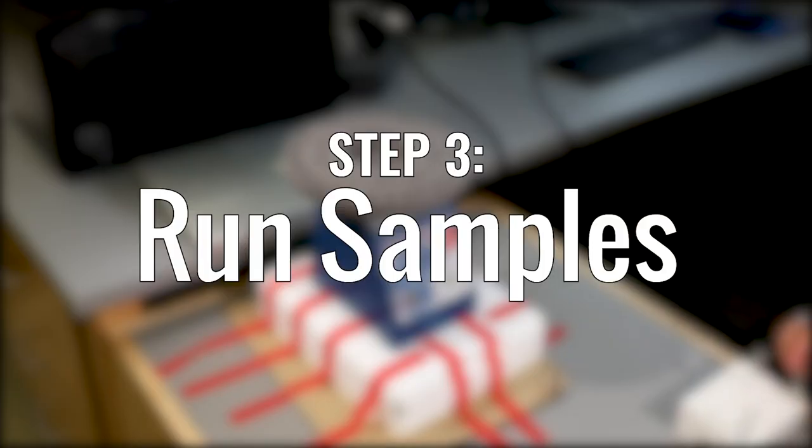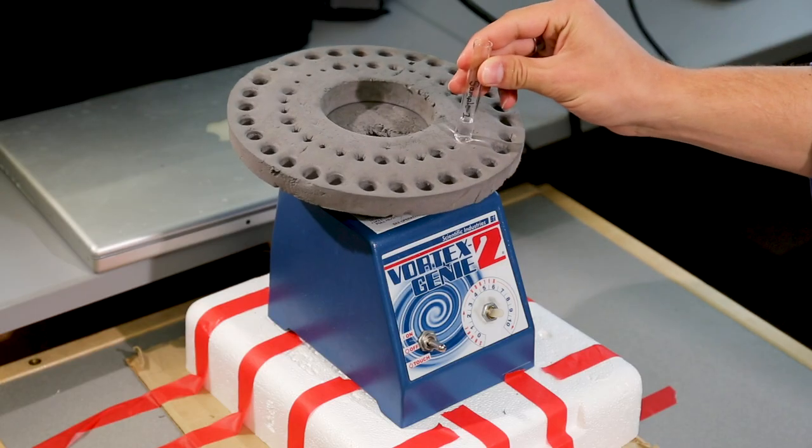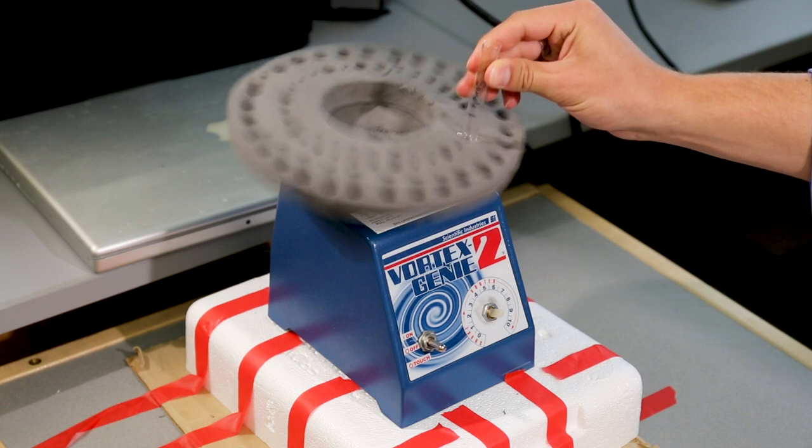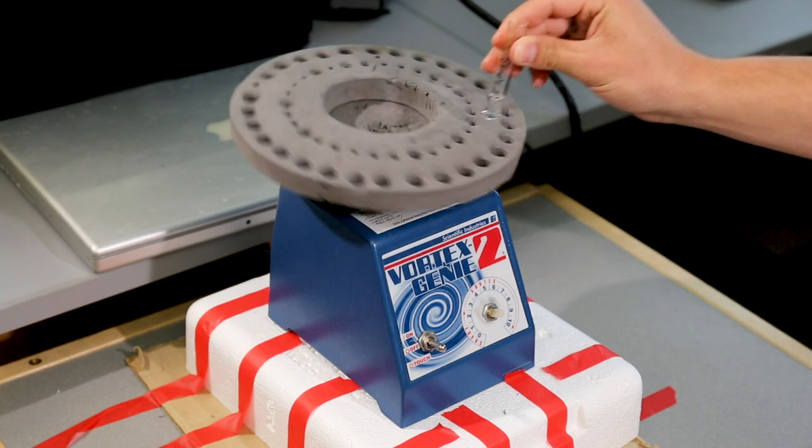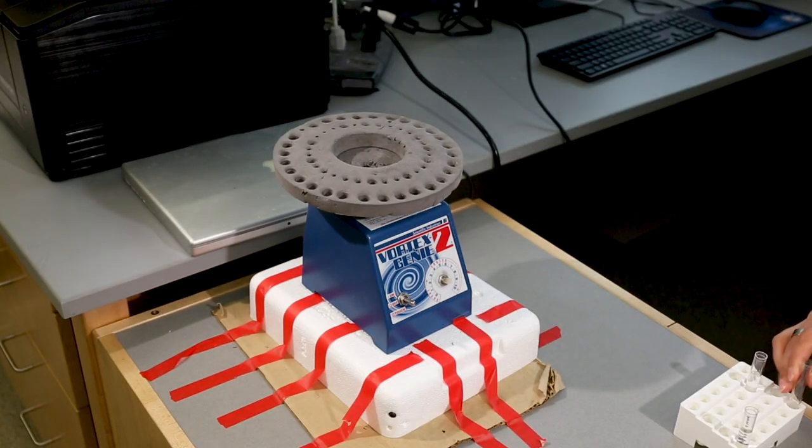Vortex your samples immediately before running them. The vortexes should always be on the bench that's not attached to the main bay bench since vibration can negatively affect the instruments.